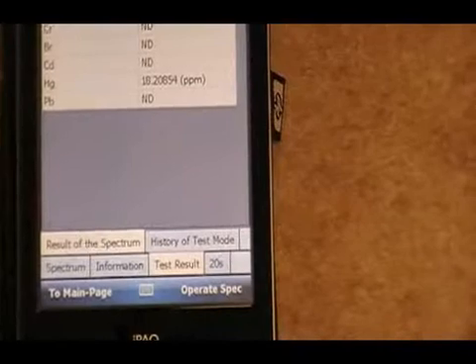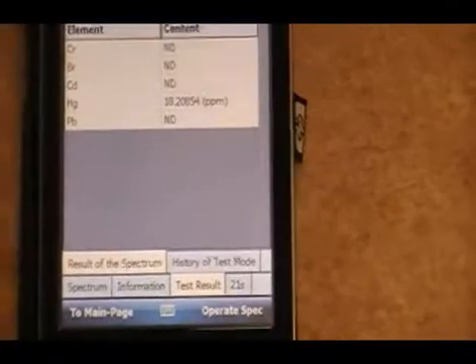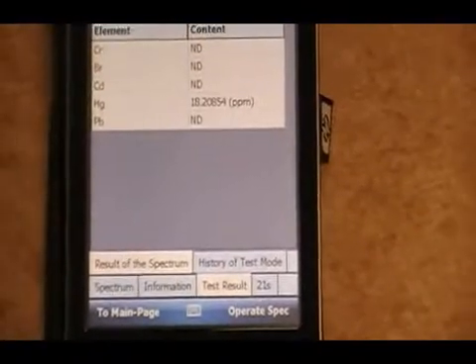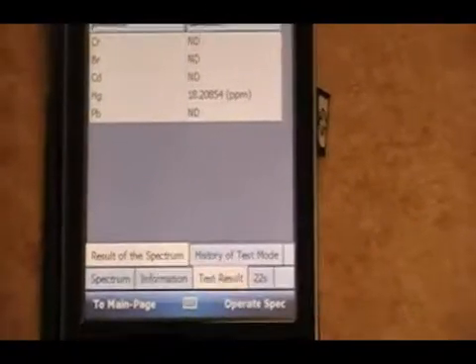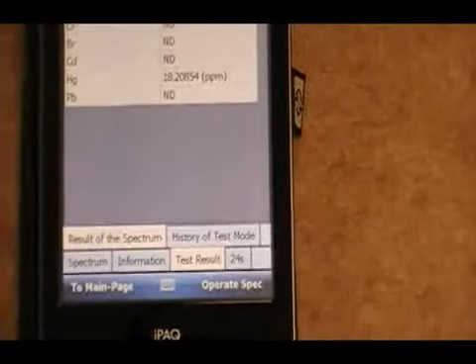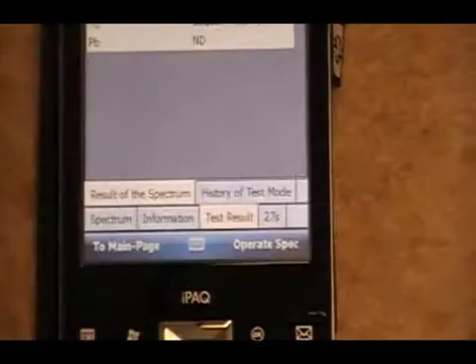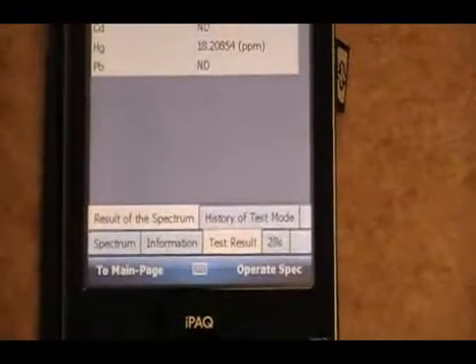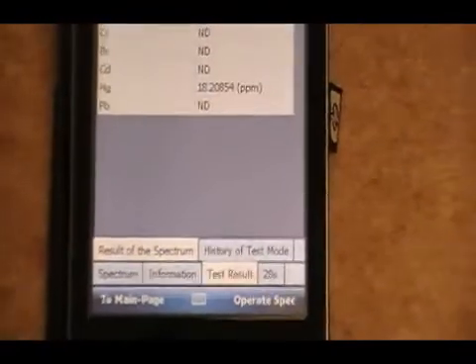Approximately every 10 seconds, it will do an update. We've got this running today at 40 seconds for demonstration purposes. The unit comes defaulted at 200 seconds.